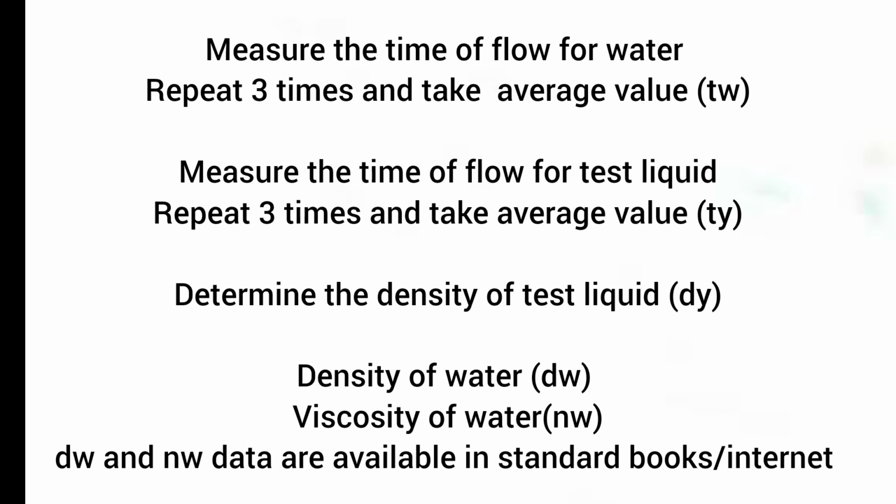Repeat the experiment 3 times and note down the average time required for the water to flow through the capillary. Next, the same experiment will be done with the test liquid, and then nothing else, you have to put the values into the equation. One thing you have to do extra, that is measuring the density of the test liquid too, and placing all these values into the equation will give you the viscosity of the test liquid, provided it's Newtonian.